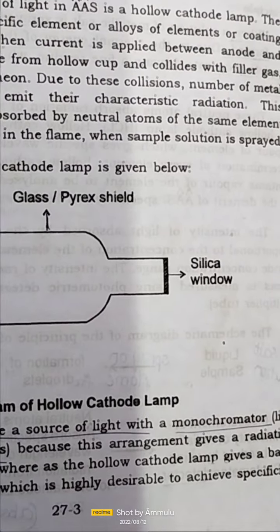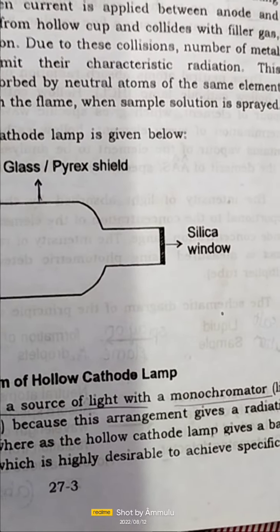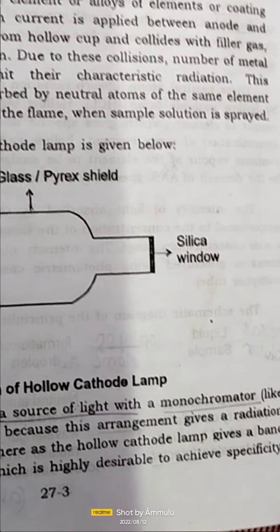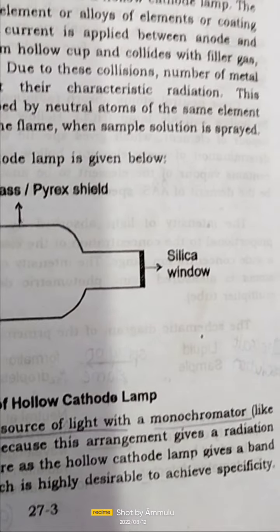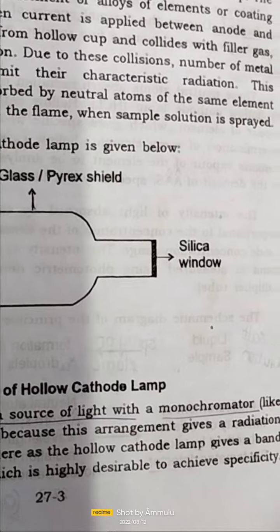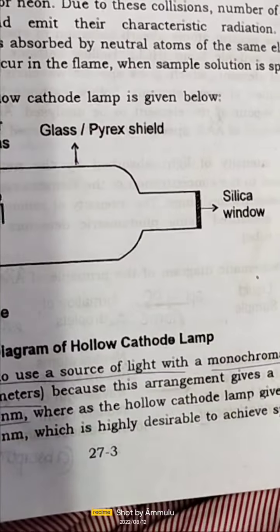It is not possible to use a source of light with a monochromator because this arrangement gives radiation with a bandwidth of 1 nanometer, whereas the hollow cathode lamp gives a width of 0.001 to 0.01 nanometers, which is highly desirable to achieve specificity. Moreover, the light source should provide a line width less than the absorption line. When compared to ultraviolet spectroscopy, here the line source should provide a narrower line width when compared to other spectrometers.